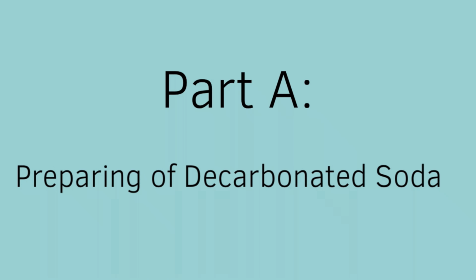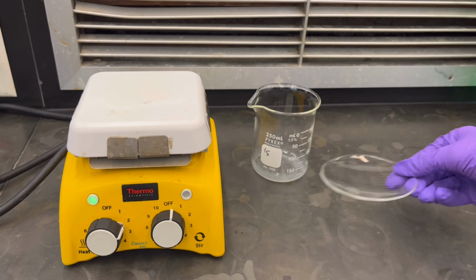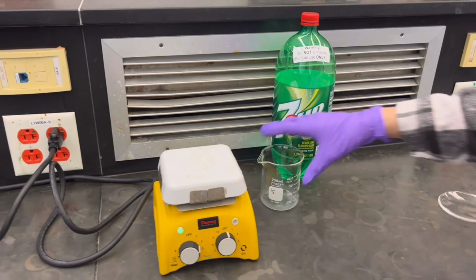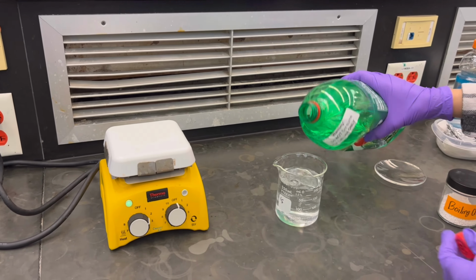Part A. Preparing of decarbonated soda. The lab equipment that we will need for this lab is a hot plate, a 250 milliliter beaker, a watch glass, boiling chips, and soda. After we got our lab equipment, we can start getting the 250 milliliter beaker. We will fill it with soda until the 200 milliliter mark.